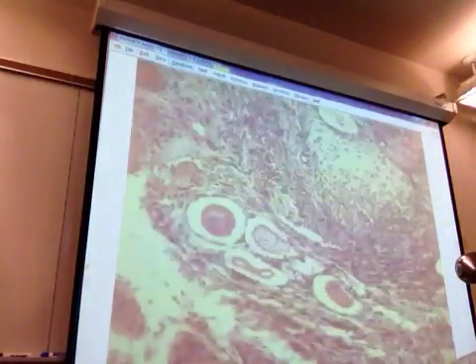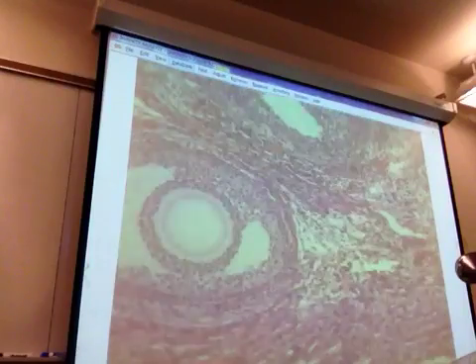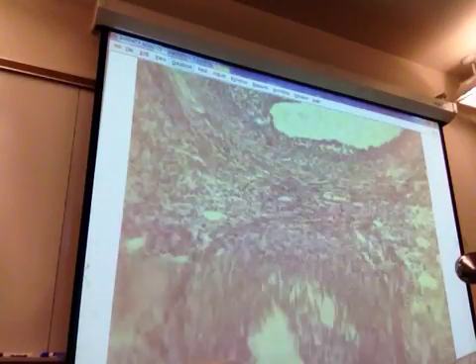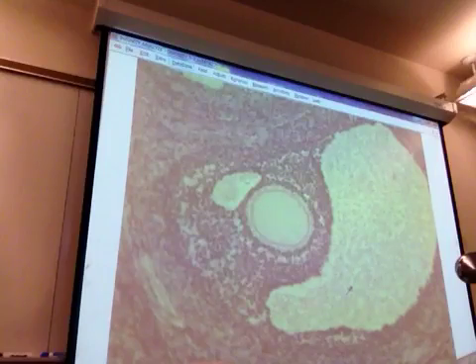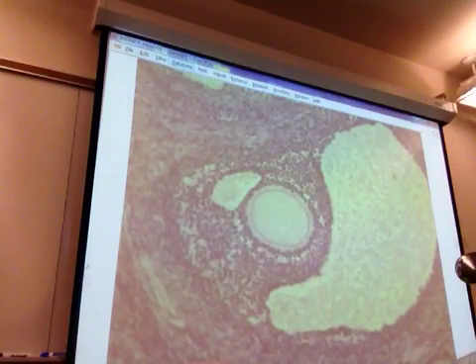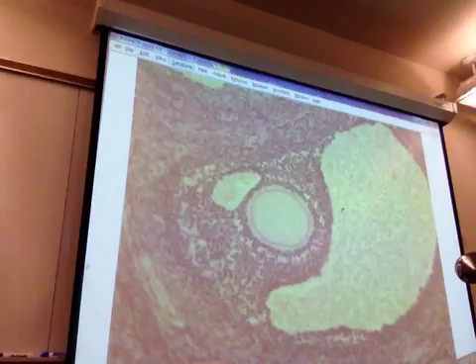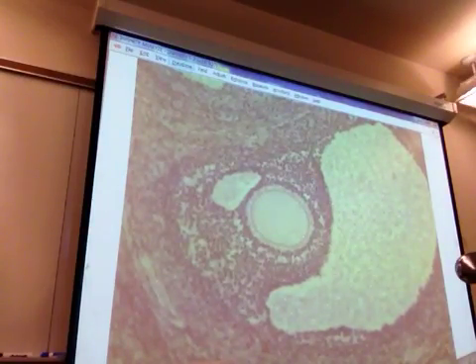Let's go back to that tertiary follicle. If I was pointing directly to these cells, not the cells down here, but the cells that are surrounding it out here, where there's a definite antrum with the follicular fluid in it. If I was pointing to these cells and I was pointing out more than one layer and it's light next to the space, that's the corona radiata.